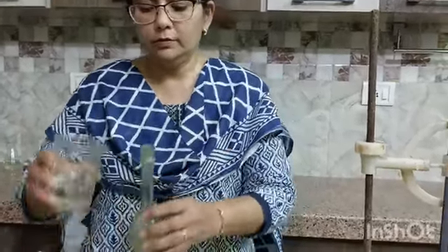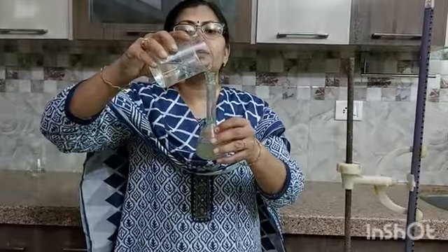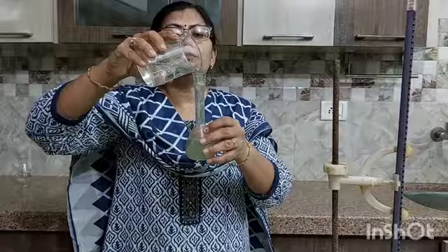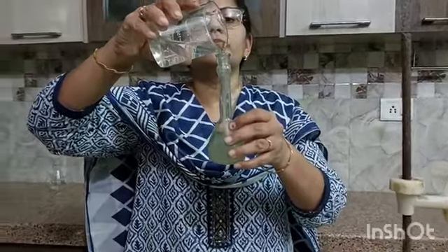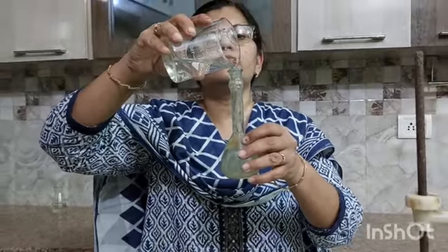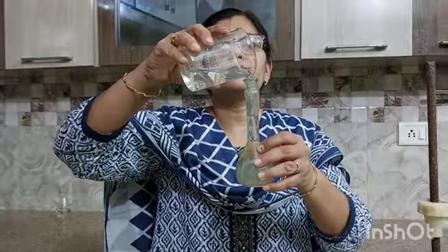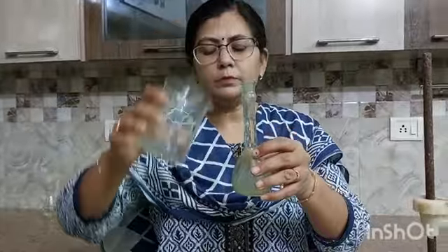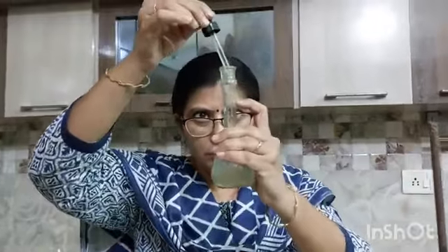And then make up the volume by adding more water up to this mark.